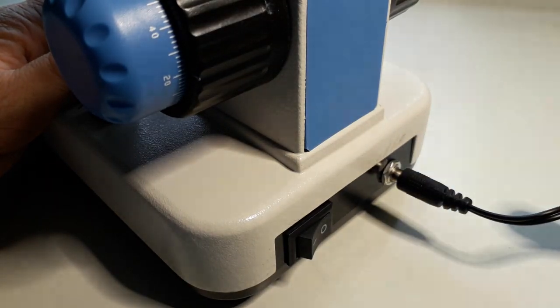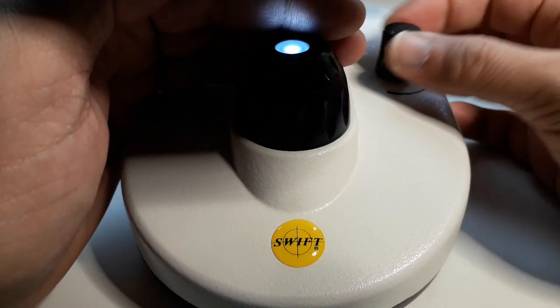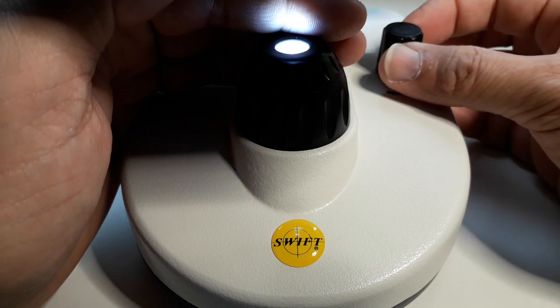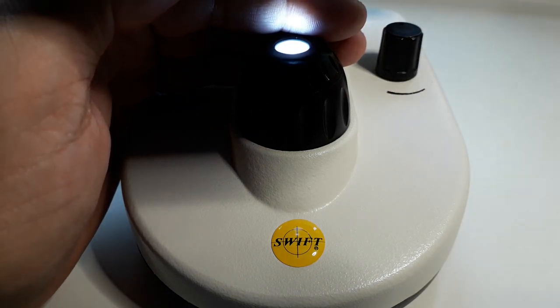And here, this is now the power supply that you can also use. And the light intensity can be regulated by turning the knob. Okay, so this is basically one single LED that you're controlling this way.